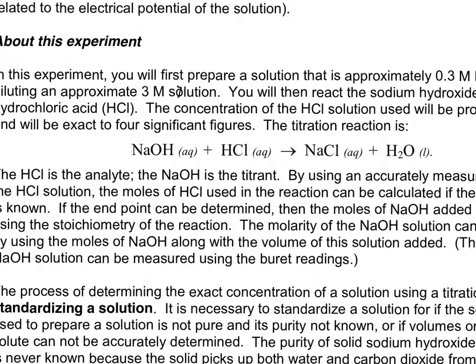In all cases, you are going with a 10.00 milliliter aliquot. Okay, in all cases. The molarity of your HCl is given on the bottle. It's 0.9001. Okay, so this is a case where you know the volume and concentration of your HCl that you're going to titrate. 0.9001 molar. Okay, and in today's calculation, basically you are after the molarity of the sodium hydroxide solution that you guys are going to make.